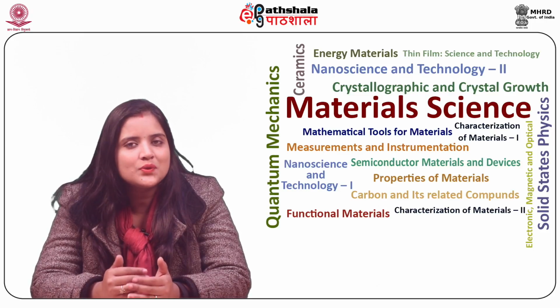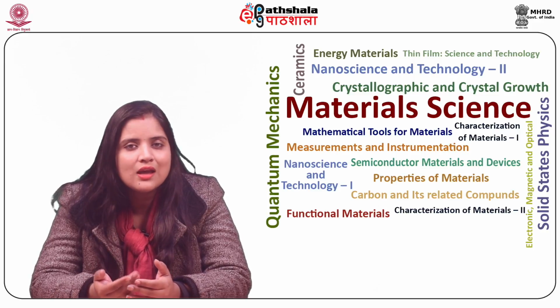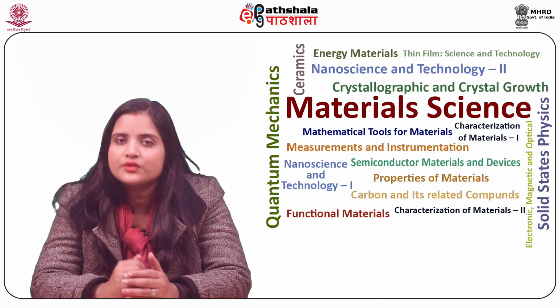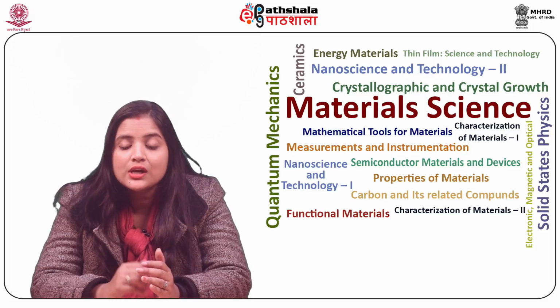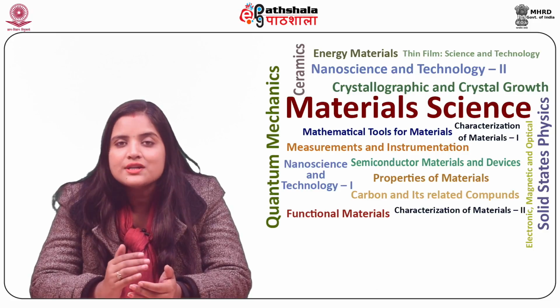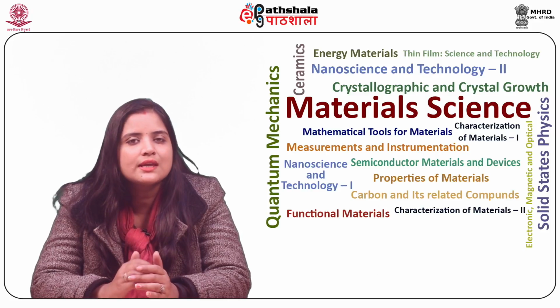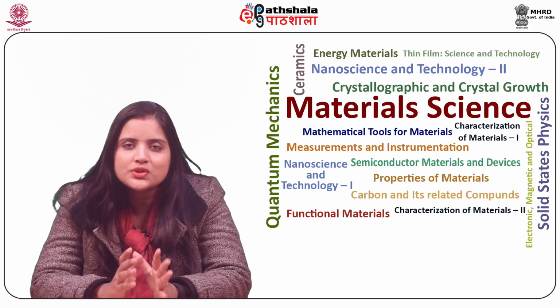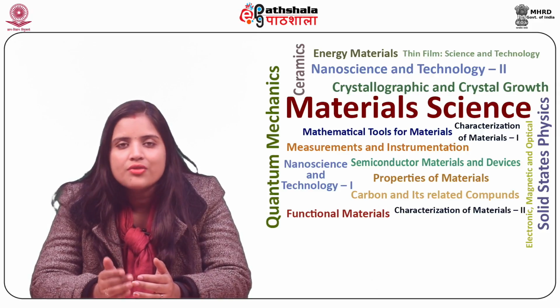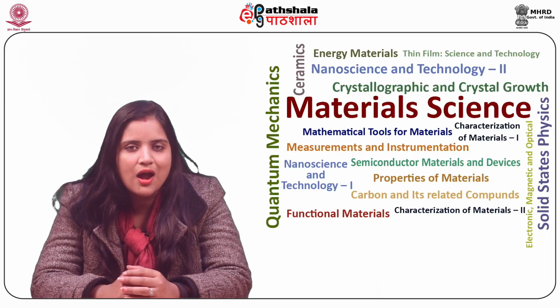Using the flat surface of crystals as well as point sources of X-rays, Bragg reflection ensures only a small part of the crystal reflects. This reflection is enhanced by placing the target, crystal and detector on the focal plane of a circle whose radius is R, also termed the Rowland circle, and bending the crystal atomic planes to a radius of 2R.